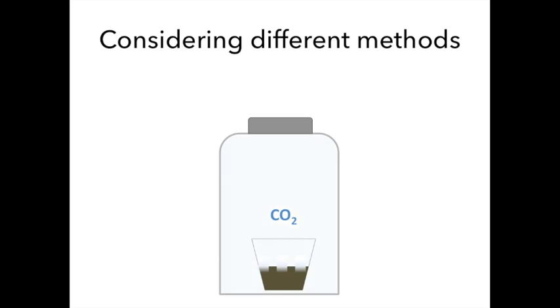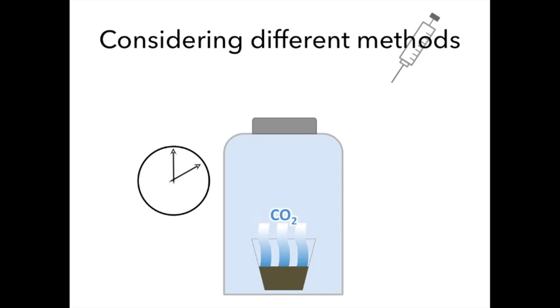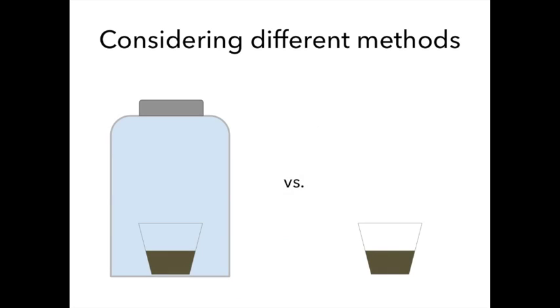It's important to note that there is more than one way to do a soil incubation. Today we have learned about a closed method, where jars are sealed except during flushing. It is also possible to keep jars open for the majority of the experiment, capping them for a short period of time, usually a few hours, prior to measurement to calculate a point flux. What do you think are some of the reasons for choosing to keep jars sealed versus keeping them open to the atmosphere?